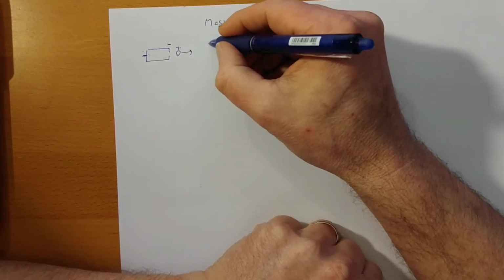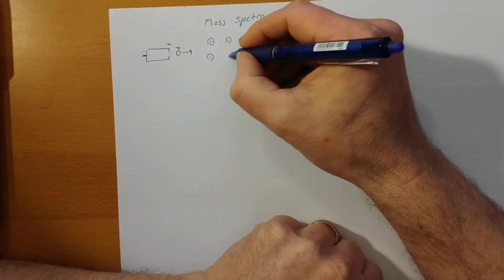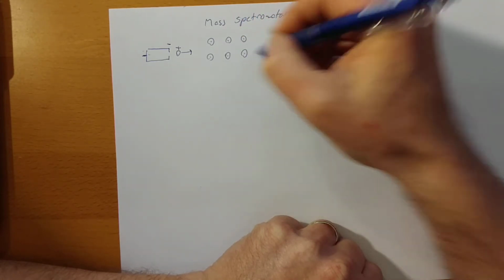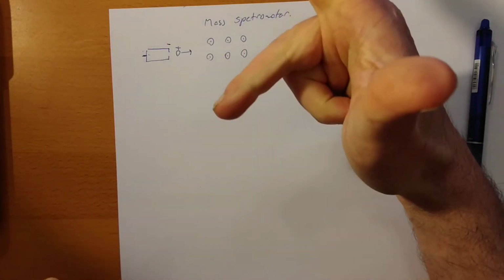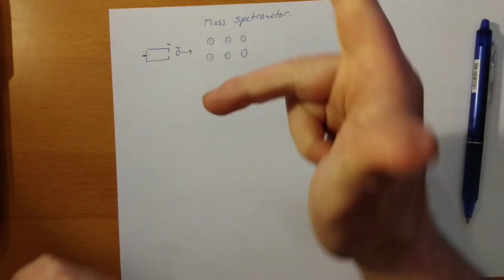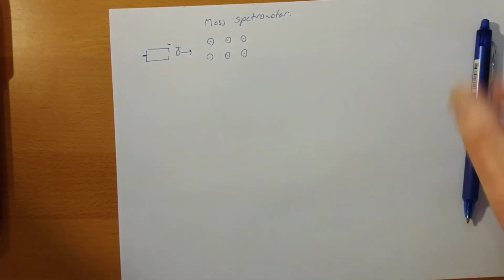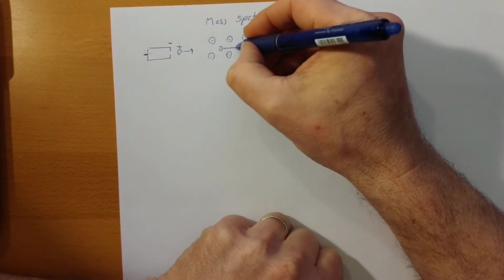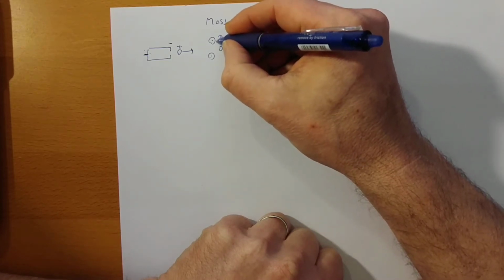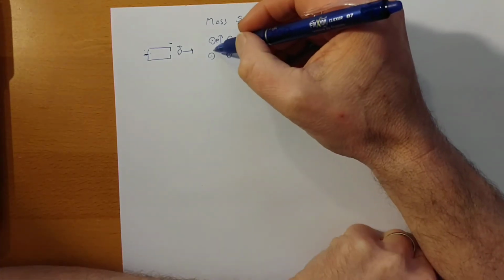And we'll let them go through a uniform magnetic field. If we do so, the field is in this direction and the particles are moving in that direction, so that is the current, the positive particles, and that means that we have a force going upwards. When the particles are inside here, they move in that direction, and we have a force in that direction due to magnetism. And that means that it curves over here.